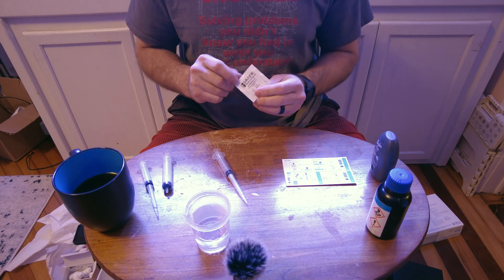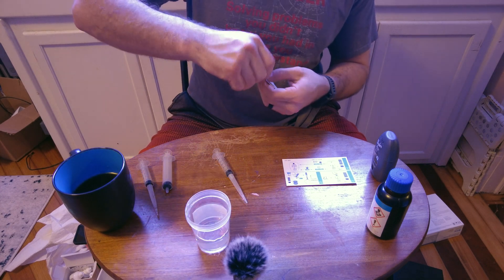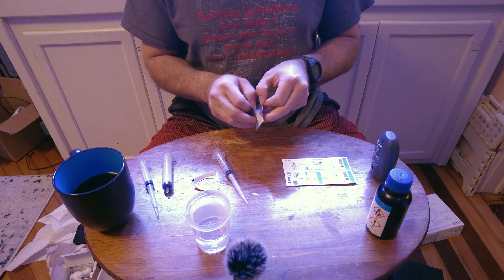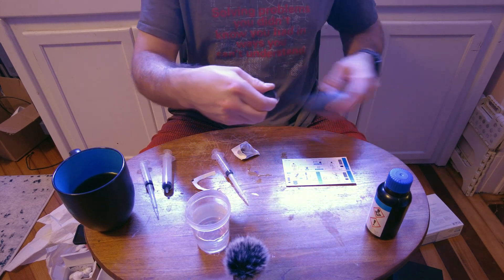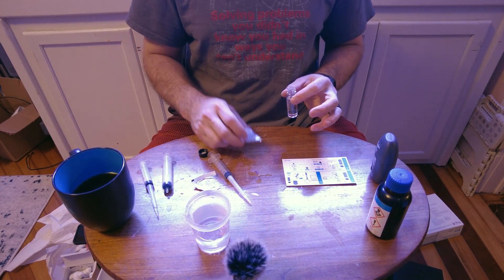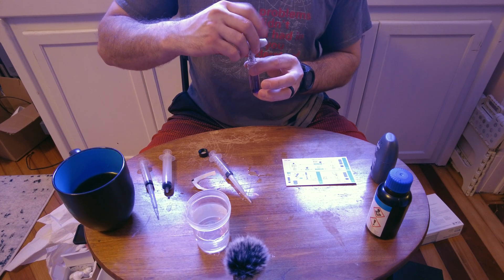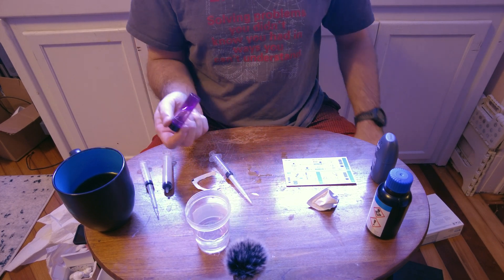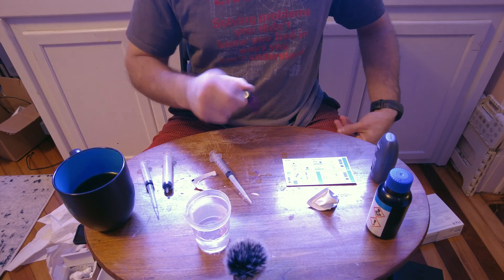I pick the corner where the lines go, flick it a few times so the powder goes into that corner, give it a quick tear around it and pop it open so it acts as its own funnel. I pinch it front and back to avoid leaving fingerprint oils that could affect the reading, and gently pour the reagent in. This says to shake or invert 18 times, or 30 seconds — it's incredibly specific — making sure no particles remain.